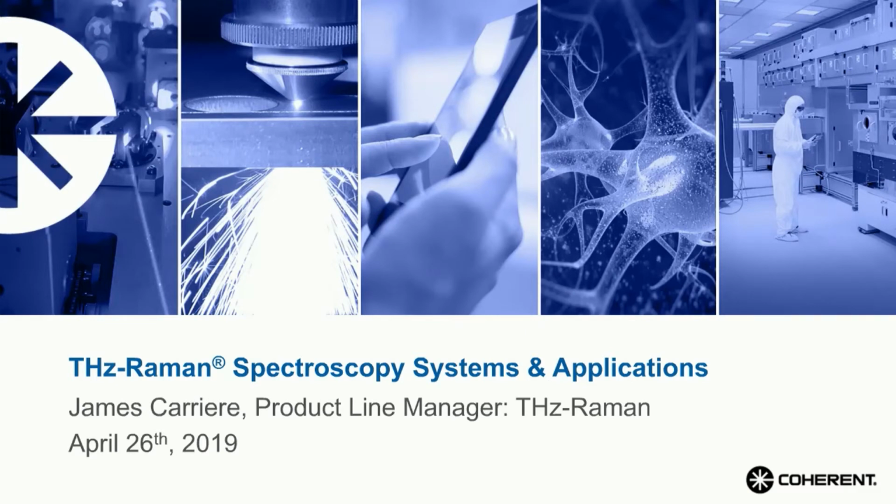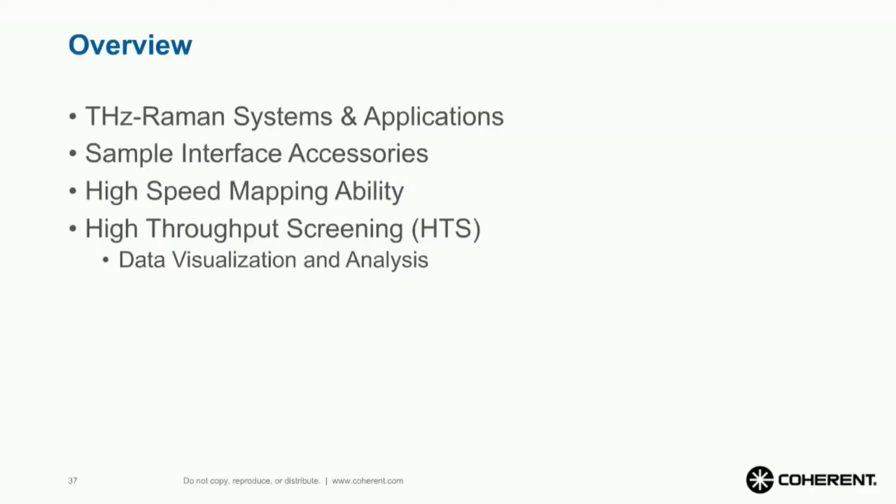Thank you, Stephen, and thanks to John and all the attendees. I think that was an excellent setup for everything that I'd like to present here. So I'd like to now shift the presentation from some of the applications to how do you actually collect this information and what equipment do you need to access these low-frequency Raman systems, or as we call it, THz-Raman, because the low-frequency portion of the Raman spectrum actually is corollary to or correlates to the terahertz absorption spectroscopy. So the same vibrational energies are achieved from Raman in this low-frequency portion of the spectrum.